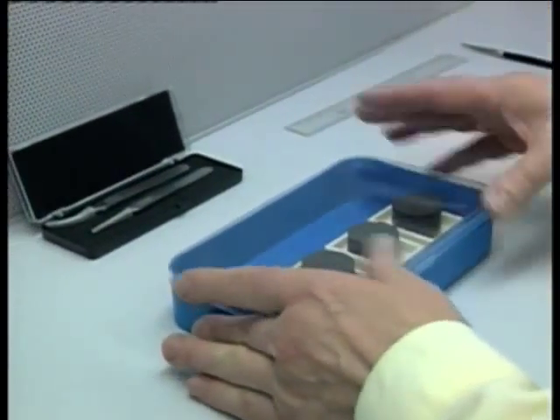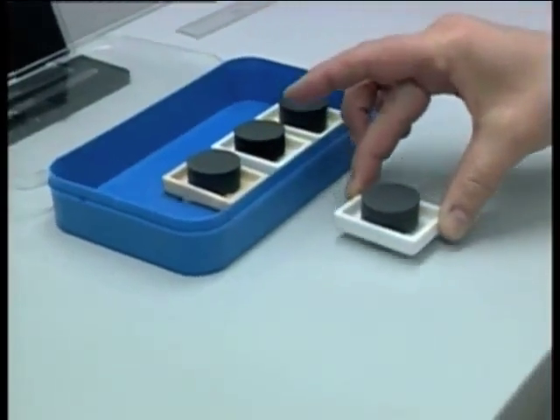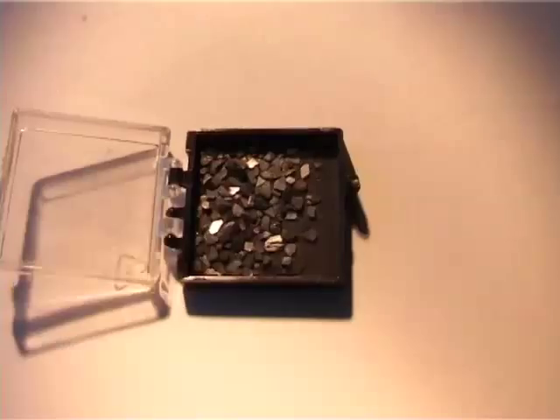A small seed crystal is now placed on the mold to produce the desired orientation of the new crystal, which will grow from the pressed powder. The seed should be structurally and chemically compatible with the 1-2-3 phase, but it should have a higher melting temperature.